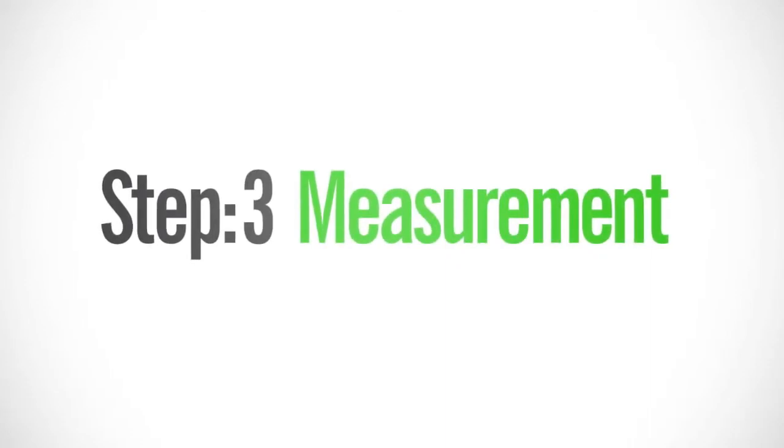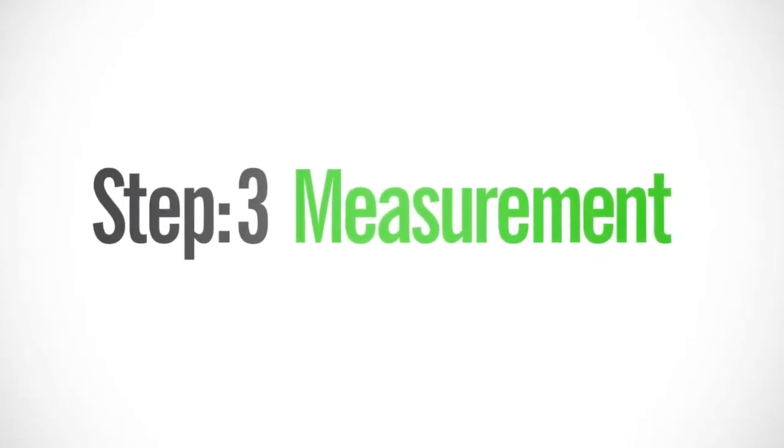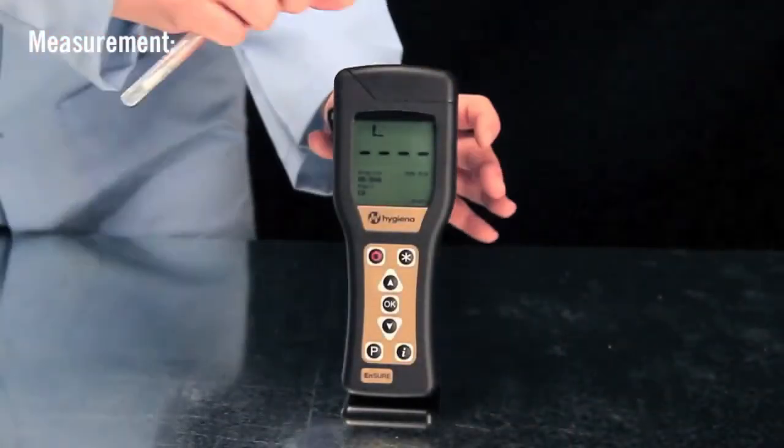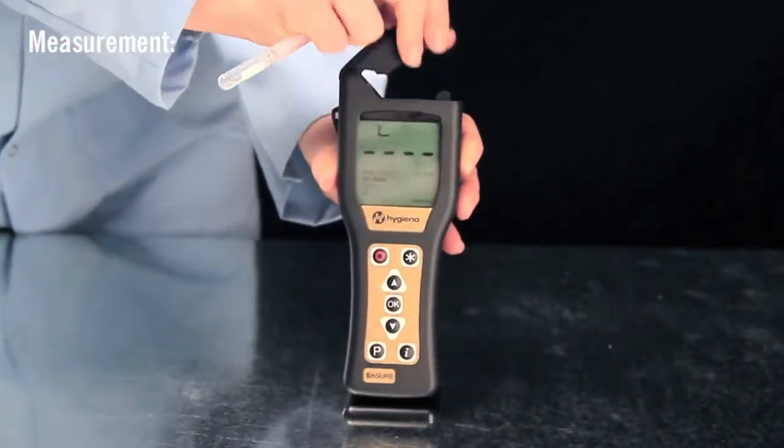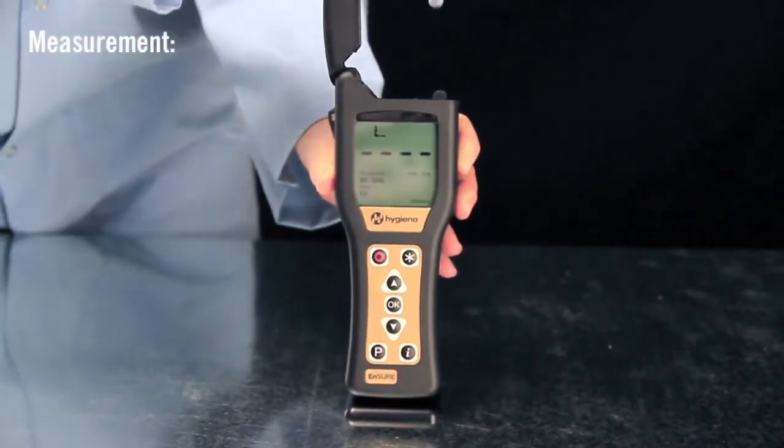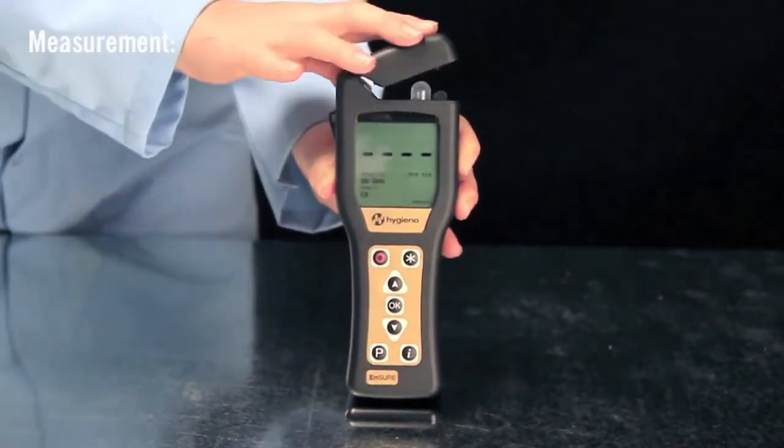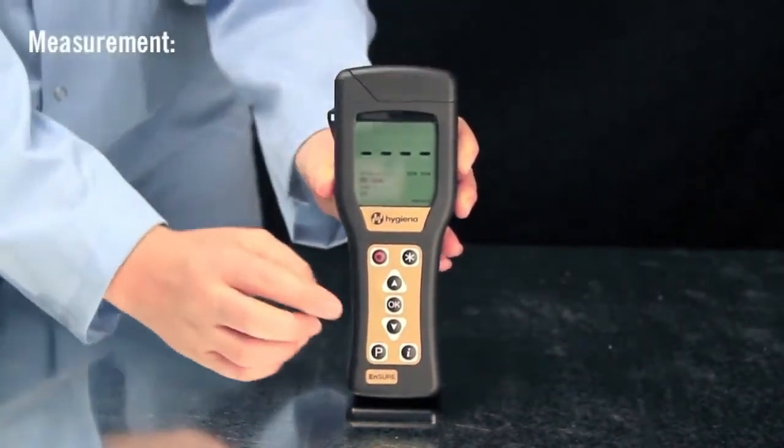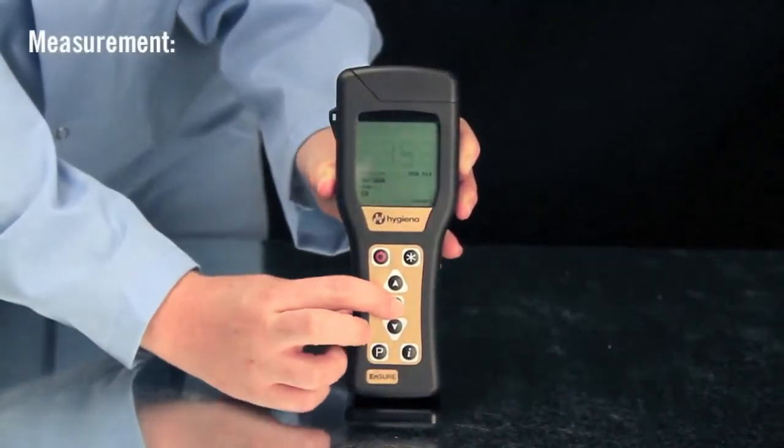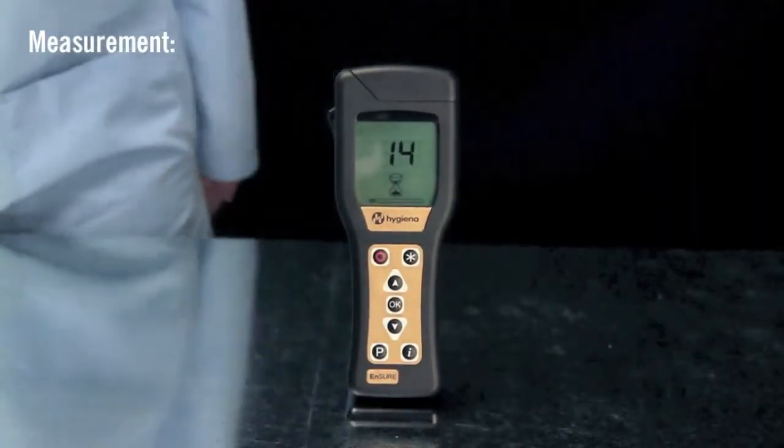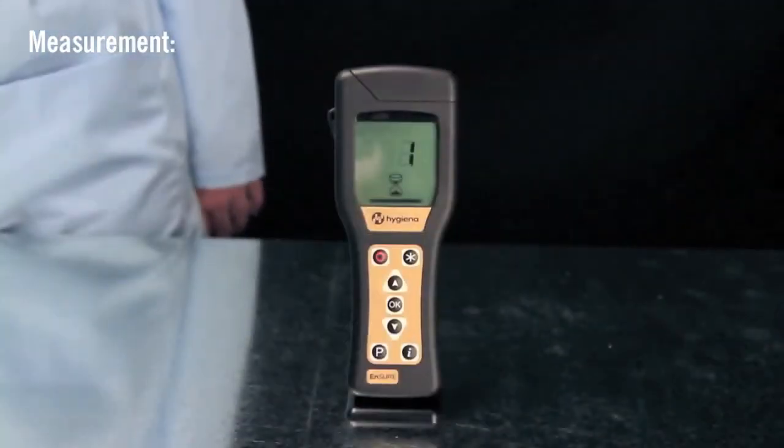The final step is measurement. Insert the swab into the reed chamber and close the lid. Hold the luminometer upright and press OK to initiate measurement. Results will be displayed in 15 seconds.